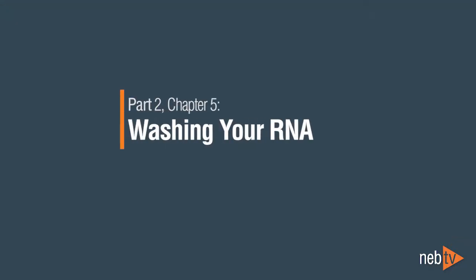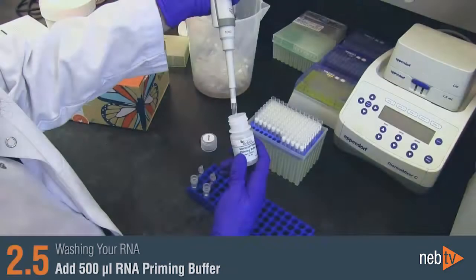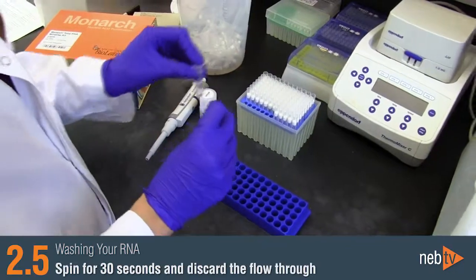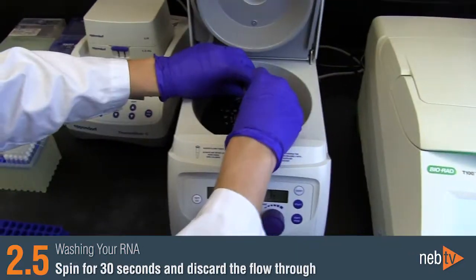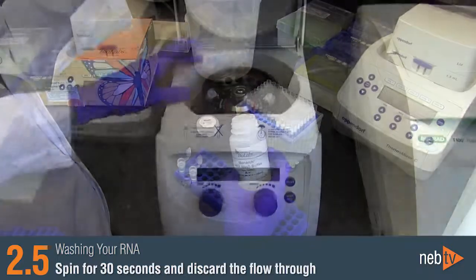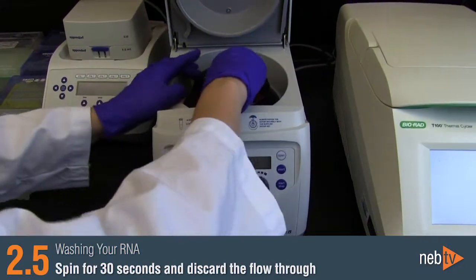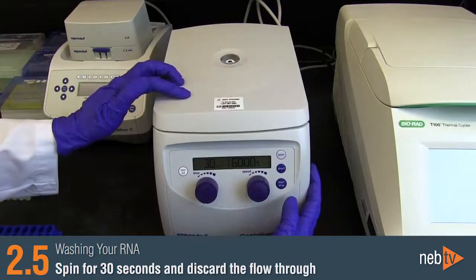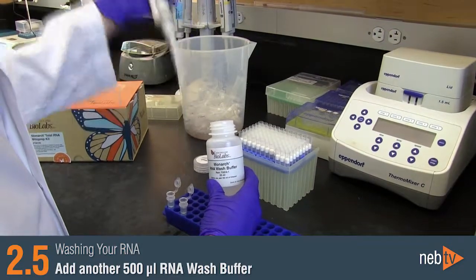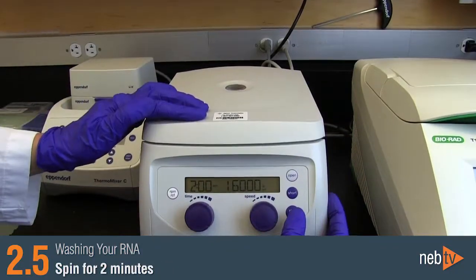Washing your RNA. Add 500 microliters of RNA priming buffer and spin for 30 seconds. Discard the flow-through. Add 500 microliters of RNA wash buffer and spin for 30 seconds. Discard the flow-through. Then add another 500 microliters of RNA wash buffer and spin for 2 minutes.